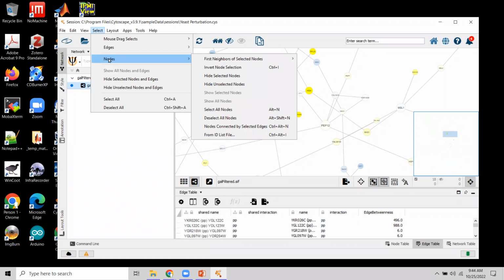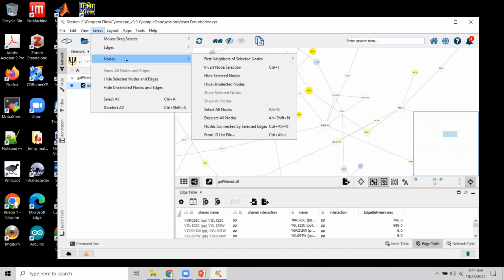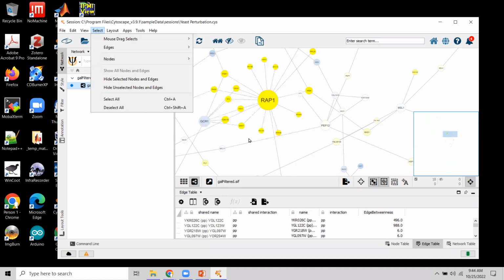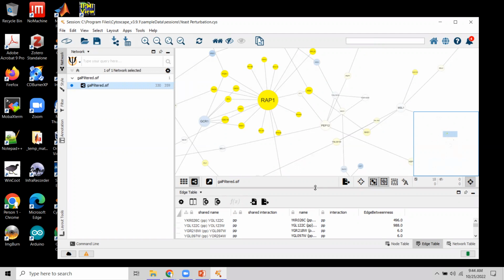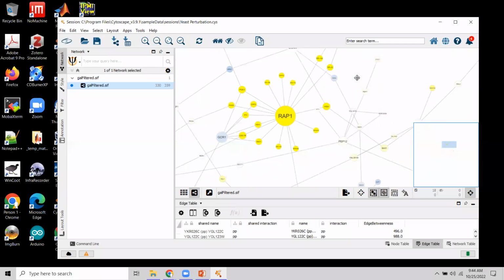It makes you work faster essentially, and reduces the amount of clicking you've got to do. Sometimes those things hiding here might be useful. So that's basic manual modification of individual things or regions of the network.